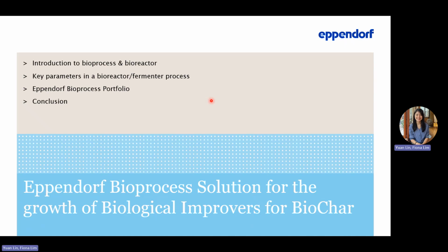Yeah, so please allow me to introduce today's topic of discussion on the next slide. My objective today is to expose the students to bioprocessing as well as bioreactors in general. So I would speak about some of the key parameters in a bioreactor or fermenter process and what Eppendorf can offer in this area. This is the agenda for today's presentation.